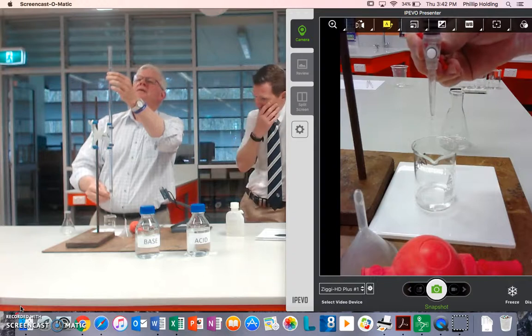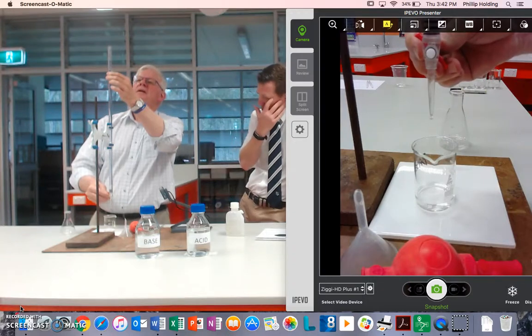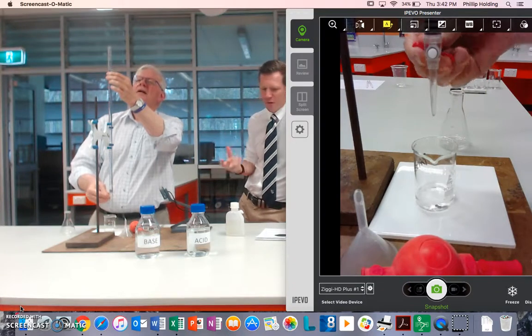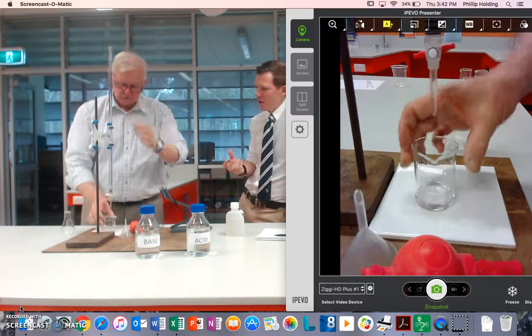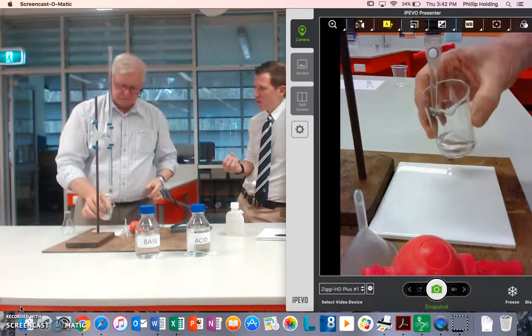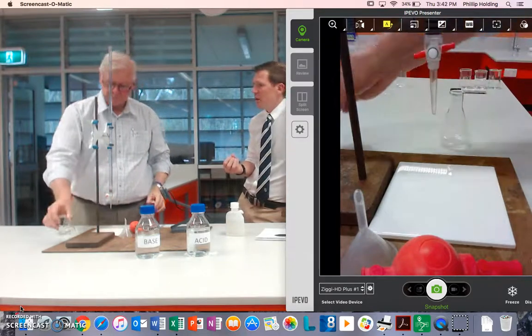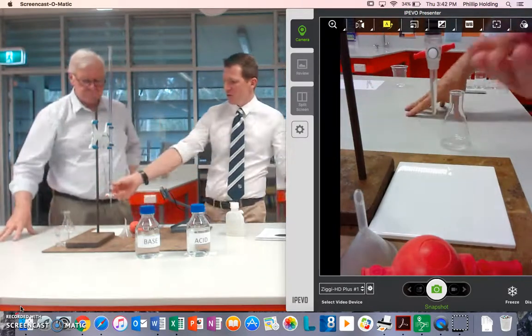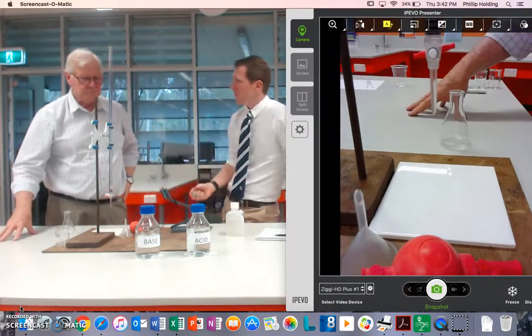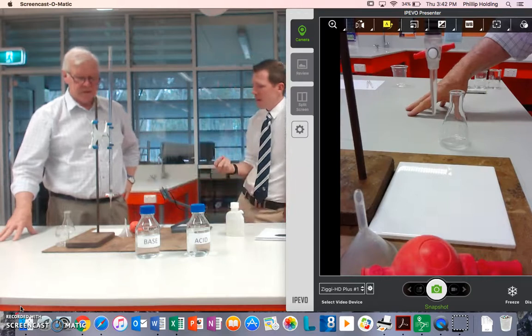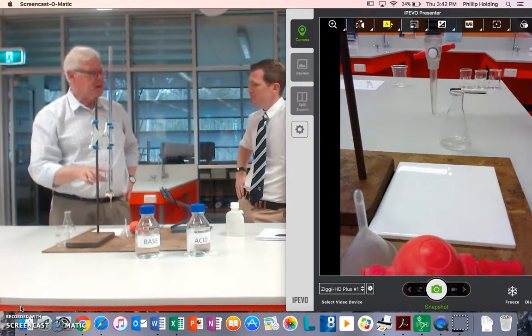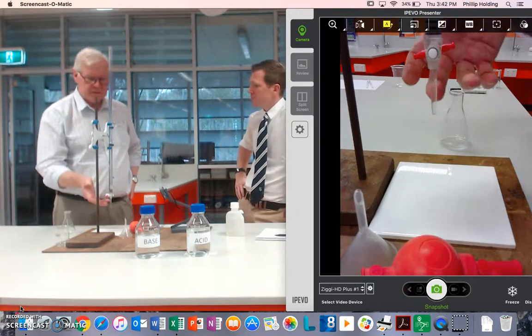And so you're being very fine there with your movements there. Obviously, we're filling, so you can go a bit quicker than you would in titration. So obviously, using this isn't important? Yes. And being familiar with it? And the hardest part now is the tap.